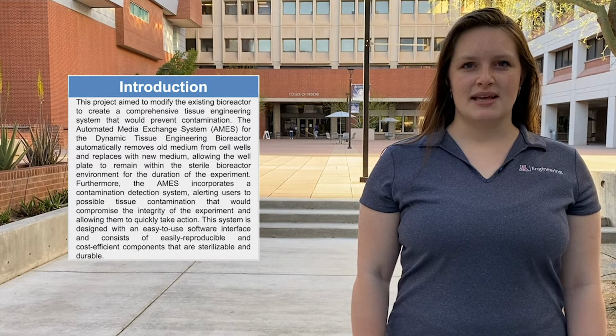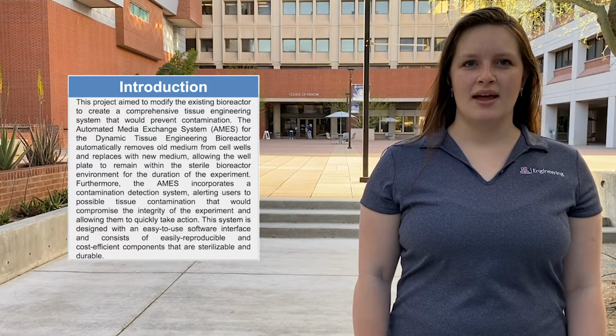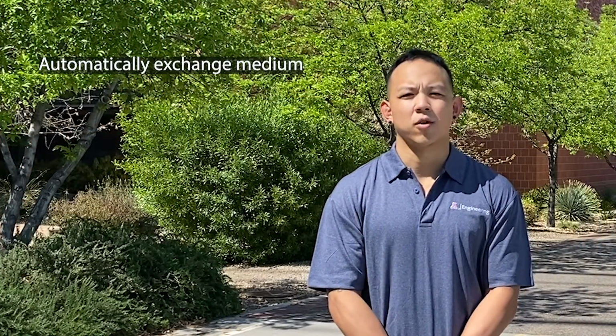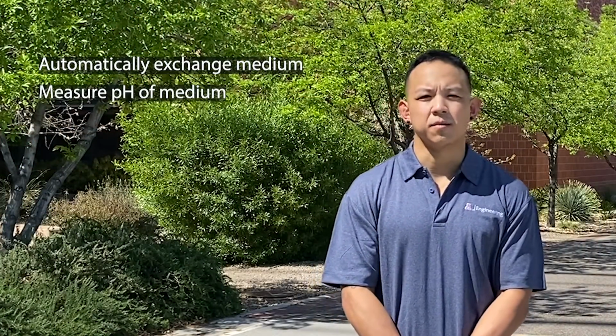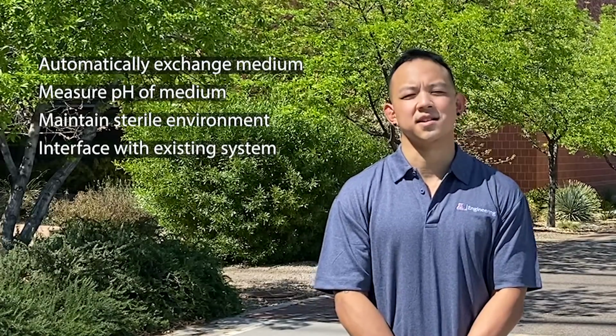This system is designed with an easy-to-use software interface and consists of easily reproducible and cost-efficient components that are sterilizable and durable. Our system must automatically exchange the cell growth medium. It must measure the pH of the medium. It must maintain a sterile environment, and it must interface with the existing system.